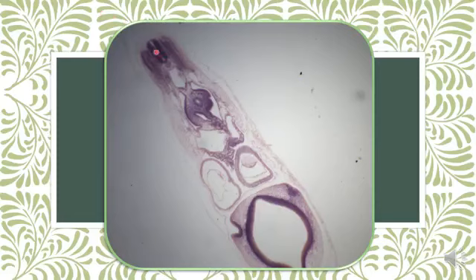Here in these sections, also dorsally neural tube, ventral to it notochord, sclerotome surrounding the neural tube and the notochord, dermomyotome, ventral to the notochord, dorsal aorta, lateral to the dorsal aorta, a cardinal vein.